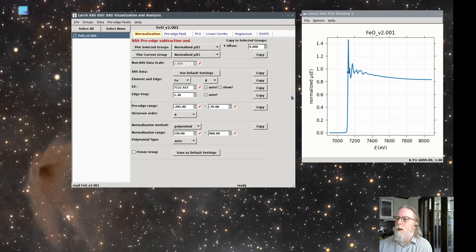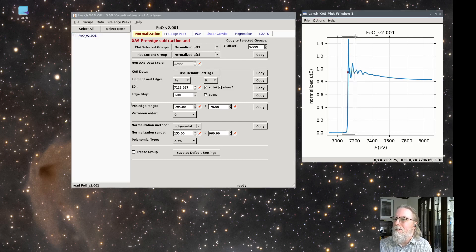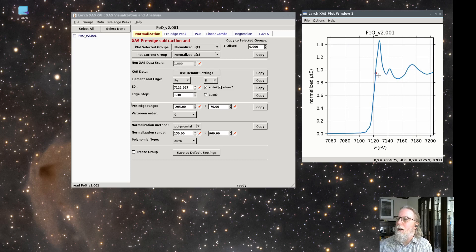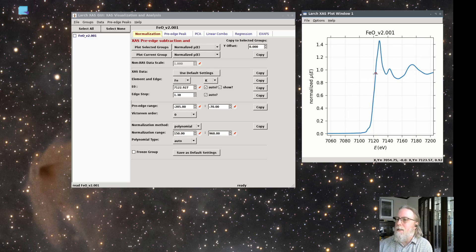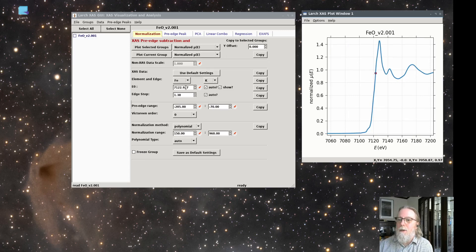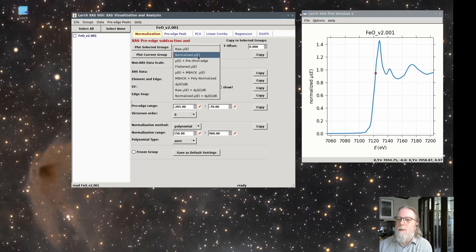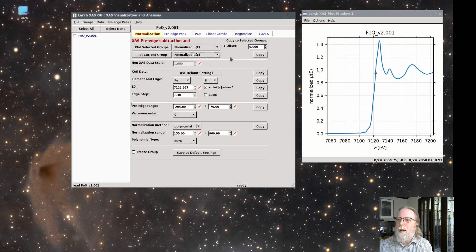And let's talk about how it got this value. So we start by determining E0, the edge position on the spectrum. And that's shown with the red dot here. And that's a value of 7123 EV. That's been selected as the maximum of the first derivative. So let me show you that.